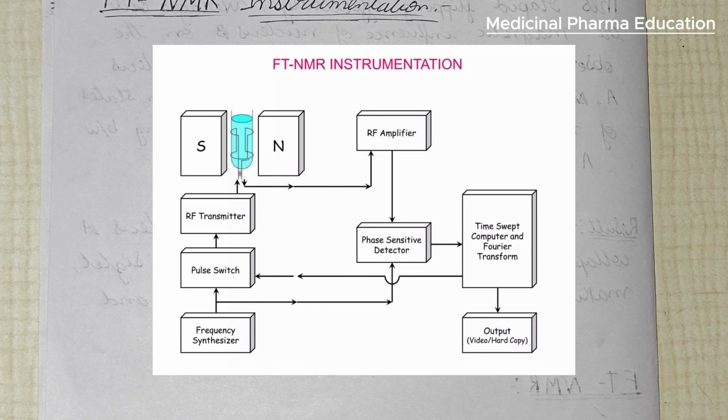The radio waves are controlled by the frequency synthesizer, and they are sent by the radio frequency transmitter.